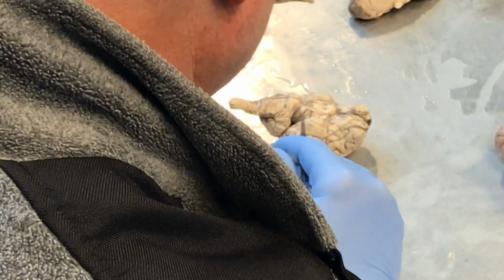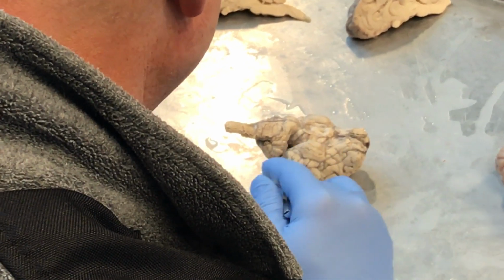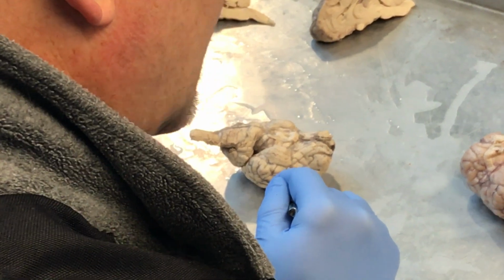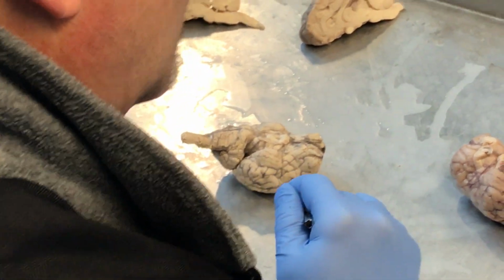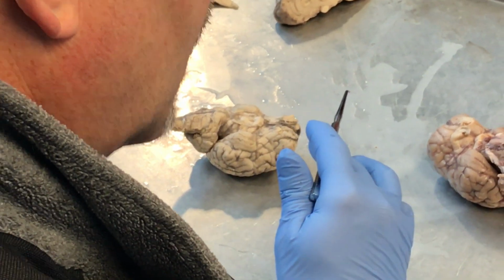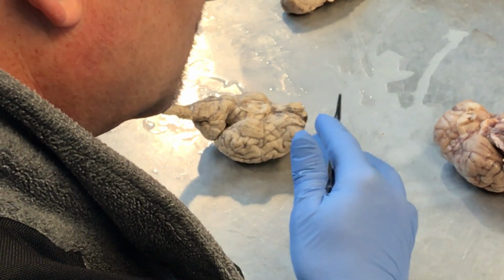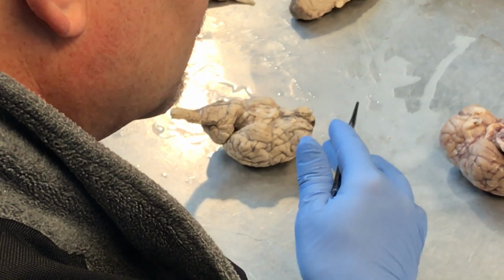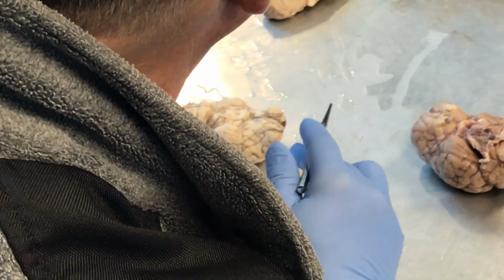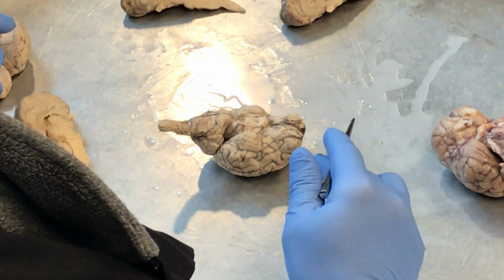All right. Let's see, cerebral peduncles, we already said those were these areas. They look like the front of the stalk, with this being the floret of the broccoli. So then you've got a bunch of nerves here. Oculomotor nerve, trochlear nerve. We talked about pons, we talked about medulla oblongata. Trigeminal nerve, abducens nerve, facial nerve, vestibulocochlear nerve, accessory nerve, hypoglossal nerve. Those are all nerves that you need to know from what? The artist rendition, the picture down below. All right?